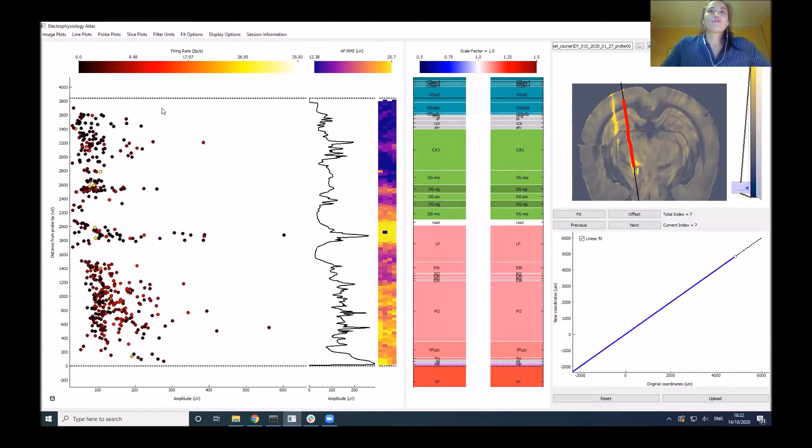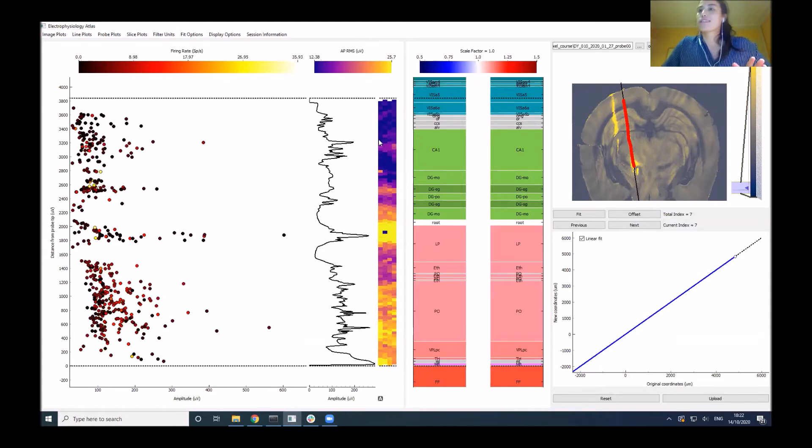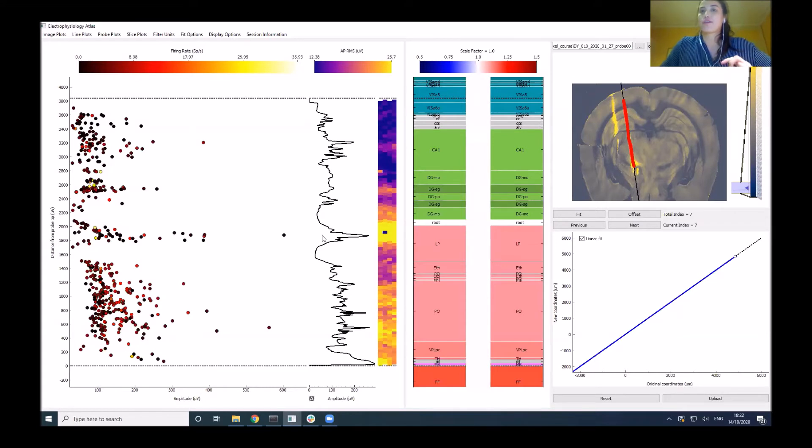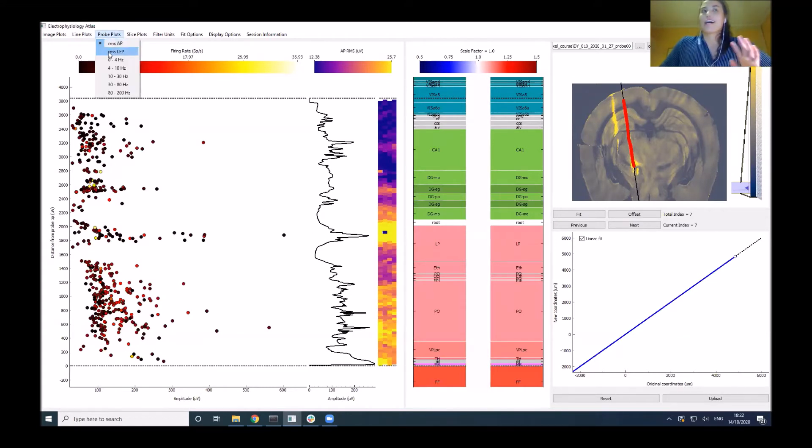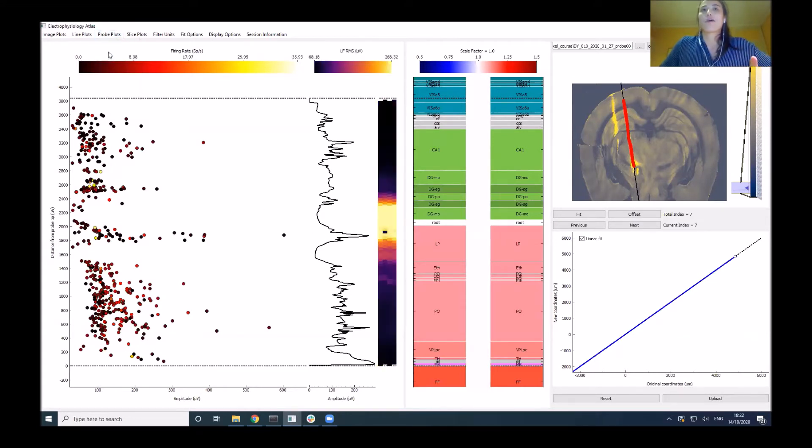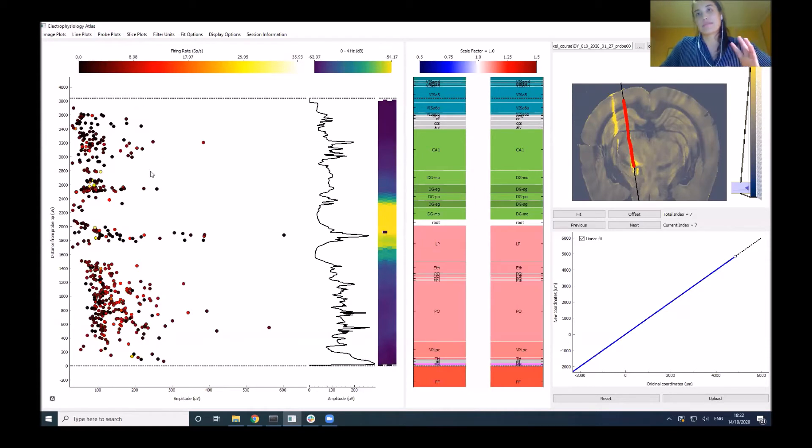Here we have probe plots that show features overlaid on the geometry of the probe. We have different options, and we can see the power spectrum in different frequency bands.